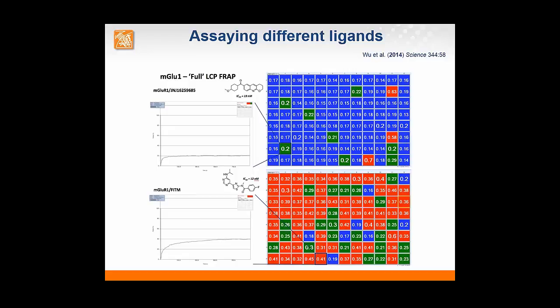And in this example, we looked at 2 ligands of very similar affinity, which have similar stabilizing property for the protein in solution. And again, in one case, the protein complex with ligand shows a good diffusion, while in the other, diffusion was very poor. And again, the protein that showed the good diffusion was the one complex that was crystallized, and we obtained its structure.